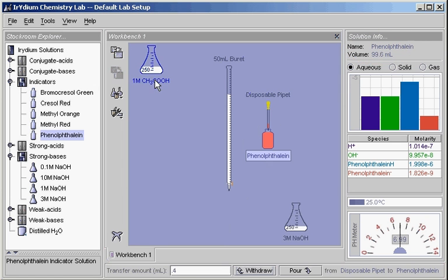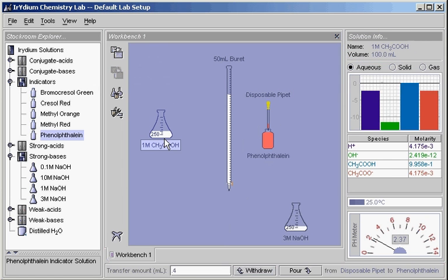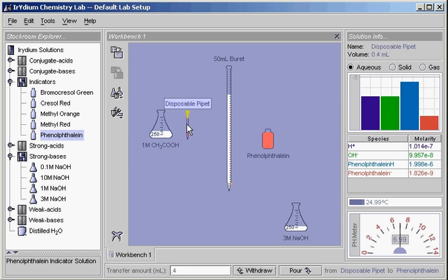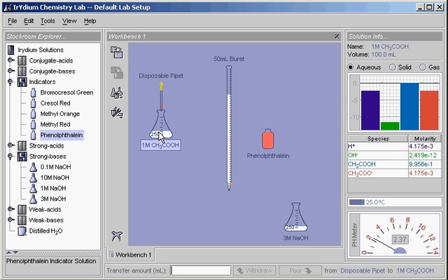Similarly, to pour, we drag the pipette onto the flask with the acetic acid, type 0.4 in the transfer bar, and click on the pour button.